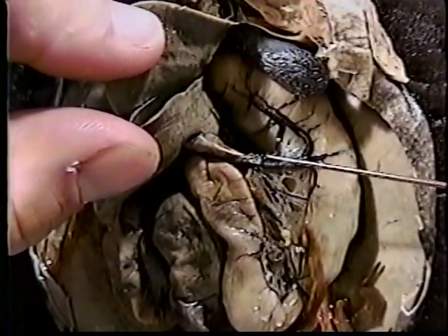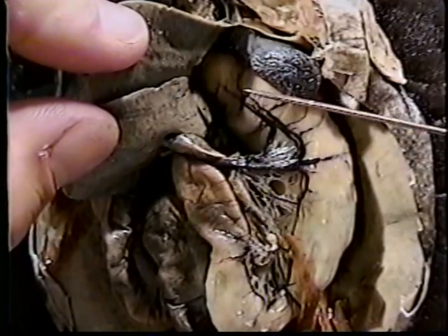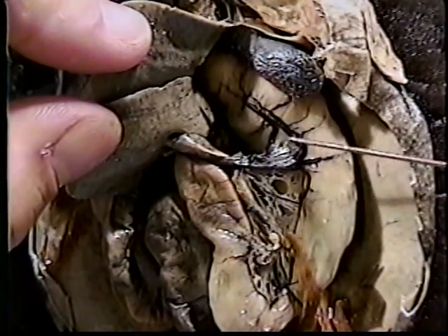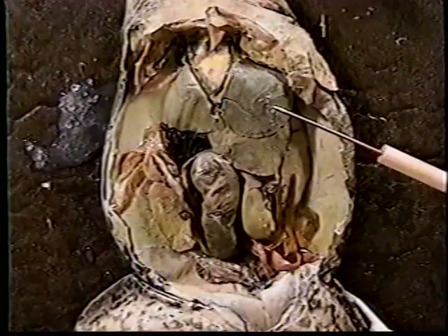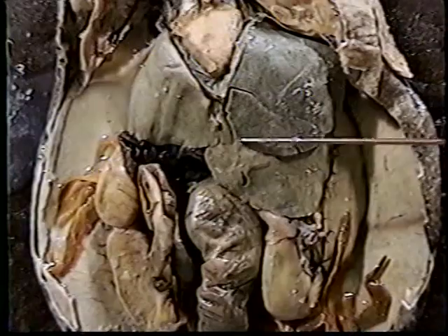From the gullet, food passes into the stomach area, in which you can examine the livers. They play an important role.